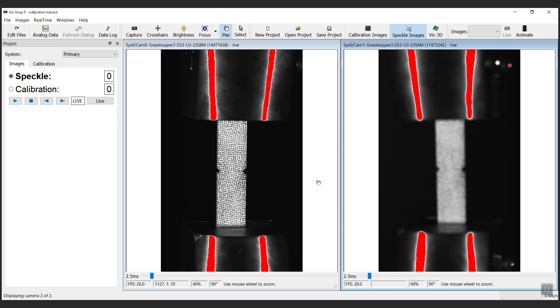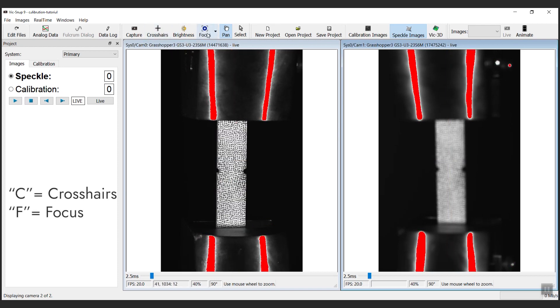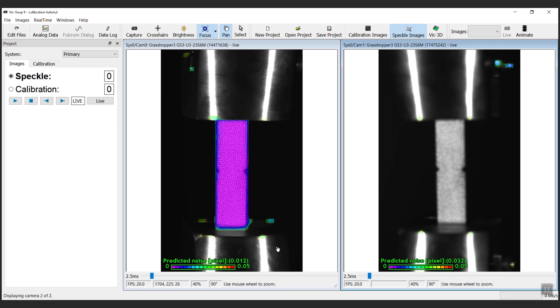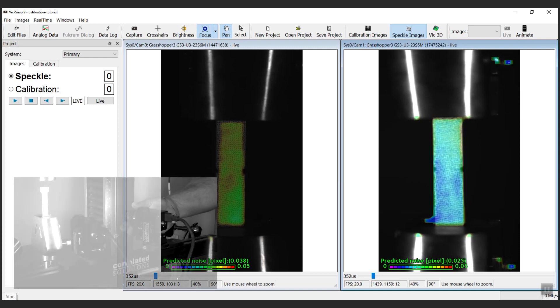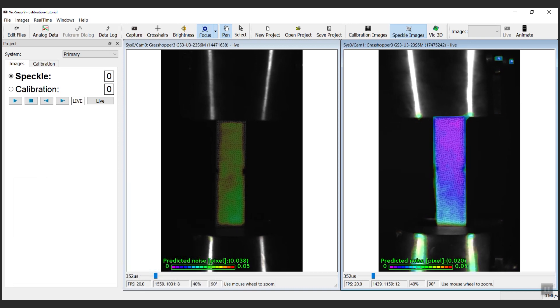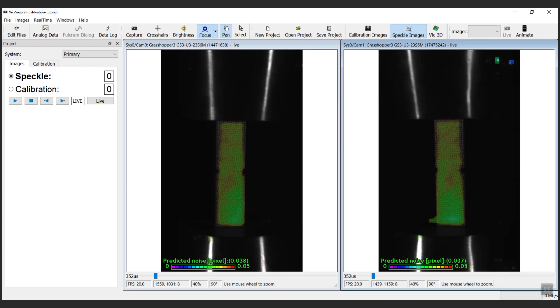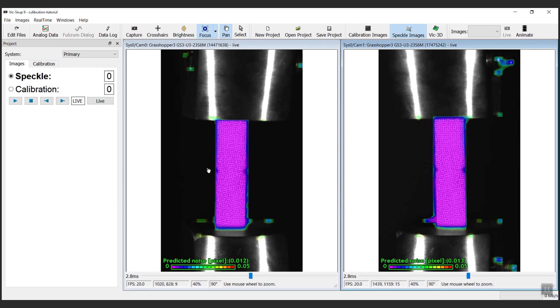VIC-Snap provides several useful tools to focus the cameras before calibration. Notice the crosshairs and focus icons in the toolbar at the top — these can be accessed in the newest version of VIC-Snap with the hotkeys C and F. Start with the focus tool. Unlock the aperture on the cameras and open to the widest setting, which lets in the most possible light. Then reduce the exposure in VIC-Snap using the slider below the image, the wheel on your mouse, or the brackets on your keyboard. Unlock the focus locking collar and focus by spinning the lens itself until you move past the lowest predicted noise value, then return so that the sample is set at the minimum value. Re-lock the focus collar, reset the aperture to a middle level, and re-lock the aperture collar to increase the depth of field around the specimen. Then increase the exposure in VIC-Snap to prepare for testing. When the focus is set, uncheck the focus tool. We are now ready for calibration.